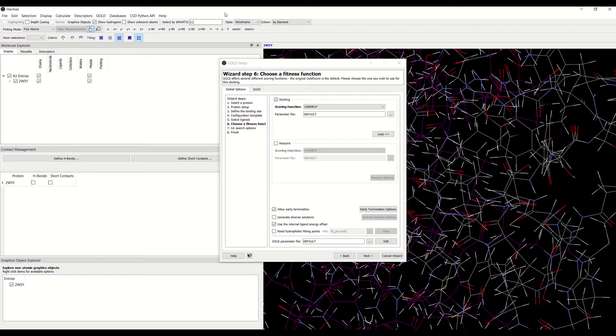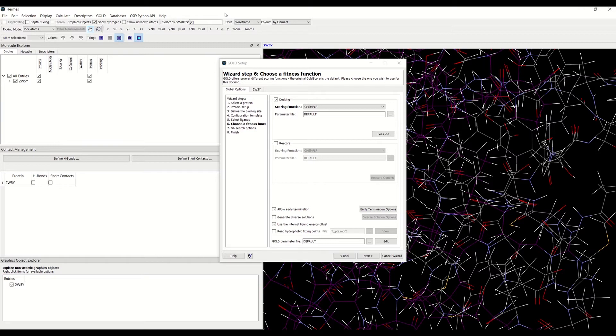The early termination option can be used to prevent GOLD wasting time performing multiple docking runs on easy ligands. It instructs GOLD to terminate docking runs on a given ligand as soon as the specified number of runs have given essentially the same answer.